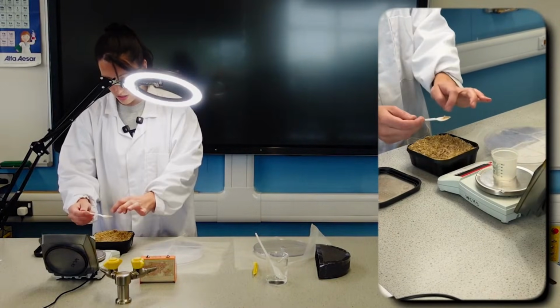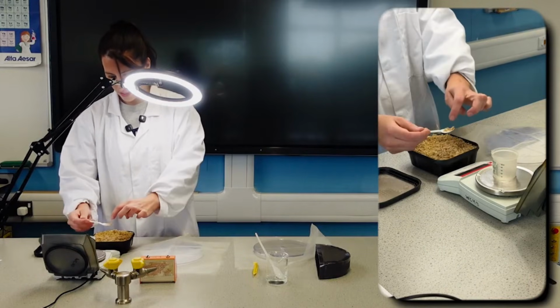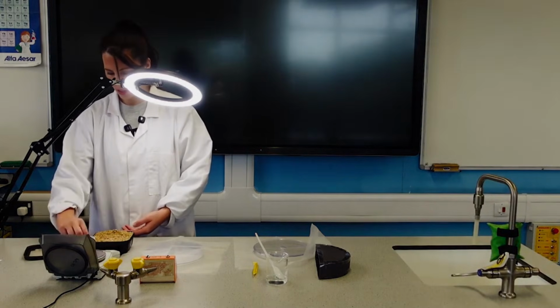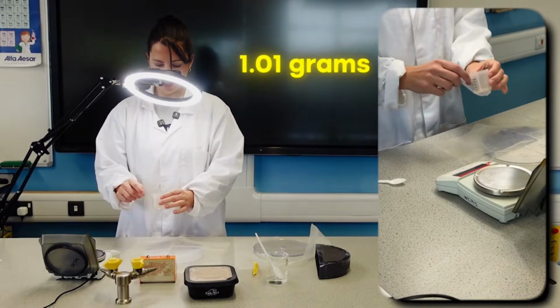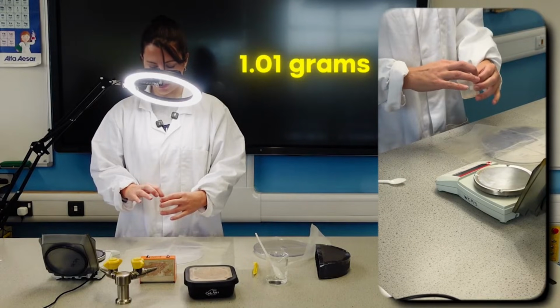So I've got 1, 2, 3, 4. Obviously I do have a little bit of sawdust in there. 5, 6, 7, 8, 9, 10. Okay, so that's my 10. So I do have a few runaway maggots. So 1.01 grams, that is the mass. I'm just going to double check we do have 10, which is quite hard when they're wriggling. 1, 2, 3, 4, 5, 6, 7, 8, 9, 10.